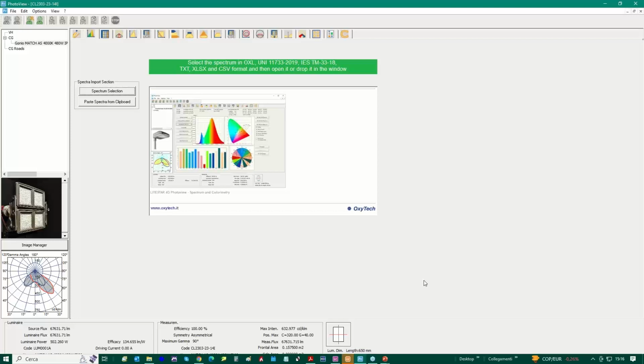So in this case, in place of having only 200 points, 200 intensities, we have 200 by 400 values, if you have a spectroradiometer with a step of 1 nanometer. In this case, you come to a total of 80,000 values that you have to manage. So it's a huge set of information. On the other hand, you can also use the program in order to import a single spectrum, so the spectrum of a point. The program allows you to do both.